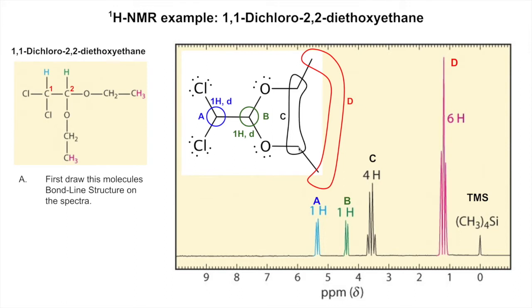And a lot of times people get confused with this, but these 2 hydrogens will not see those neighbors. It'll only see its neighbors. So this is a 2 hydrogen quartet. This is a 2 hydrogen quartet. They're equivalent, so they overlap to make a 4 hydrogen quartet. And all their neighbors are equivalent. That's why it's not a quartet or something. We'll see examples like that next.